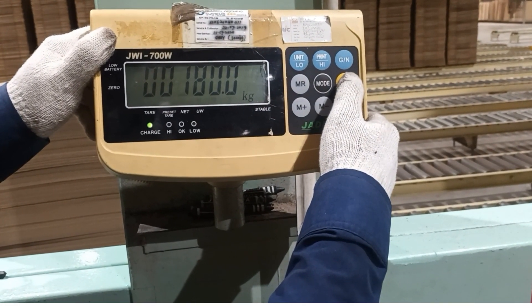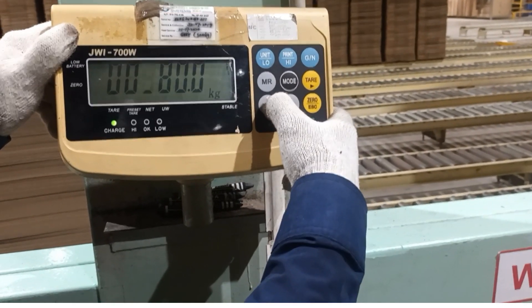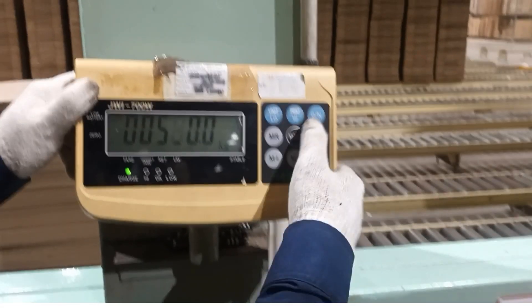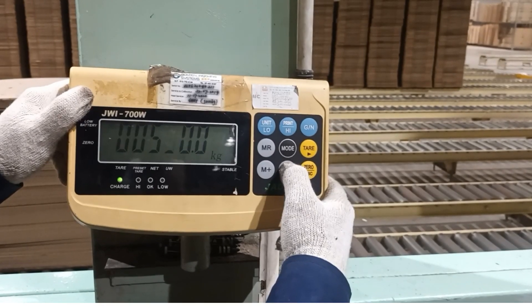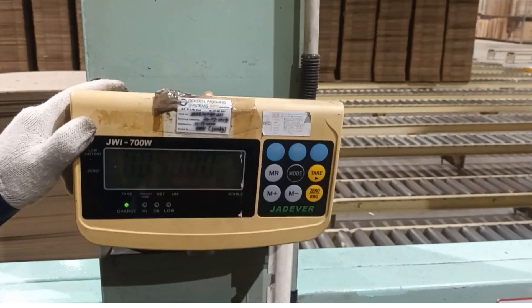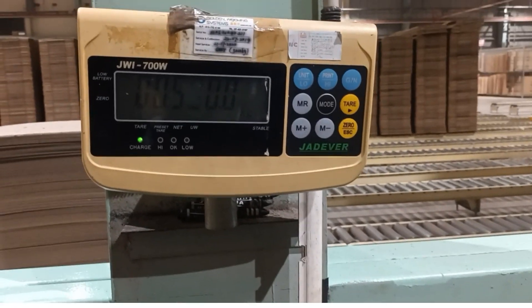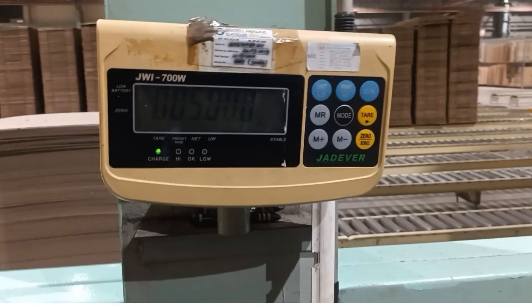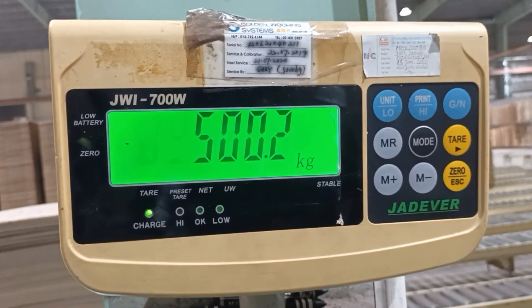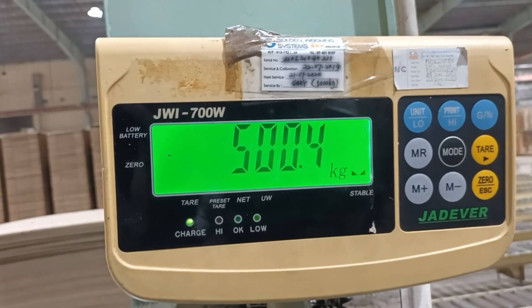The target capacity is 500 kg. I will select the value — five, then zero — to set 500 kg. Now I will place the standard weight on the scale, then press tare and wait a moment. This confirms 500 kg calibration.